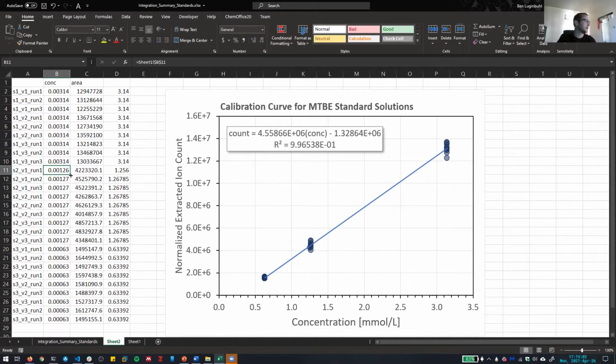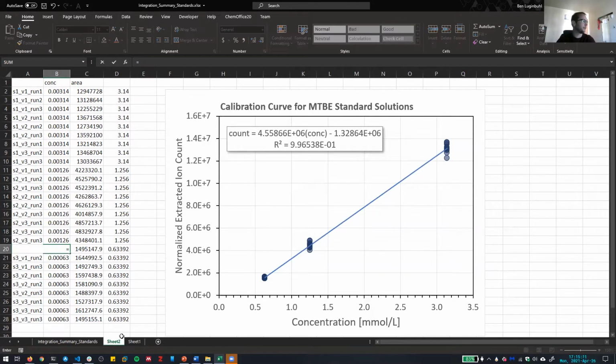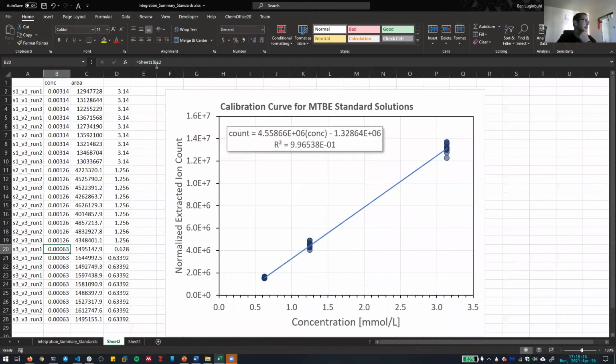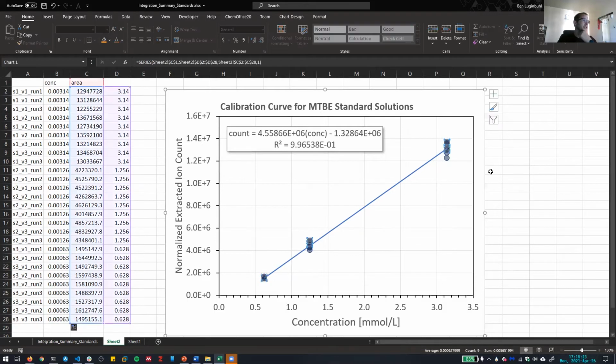That should do it, and let's drag that down. And you can see it's not changing by very much, obviously, because there's 10 microliters total. But let's do it for the final one. And I again forgot to hit F4, and now just drag that one down. And that one barely changed at all. So that now should just adjust all of these appropriately.